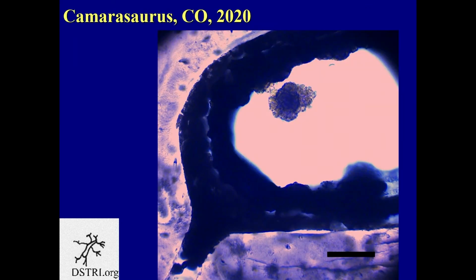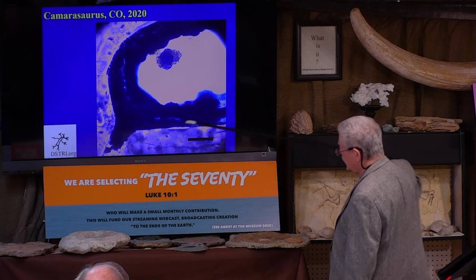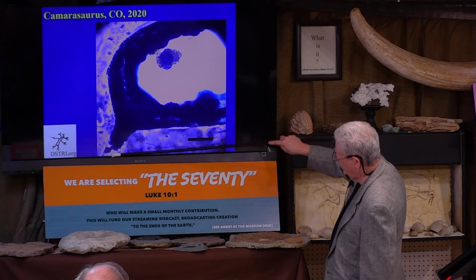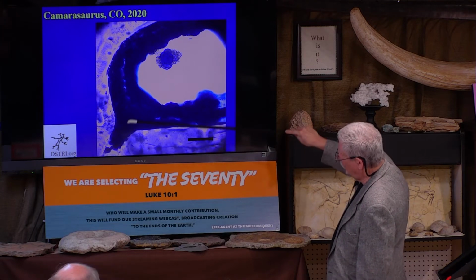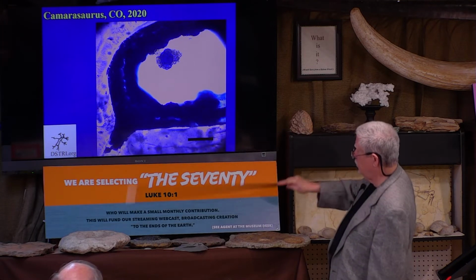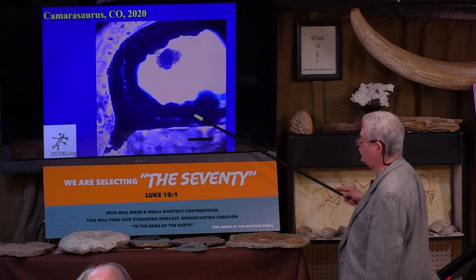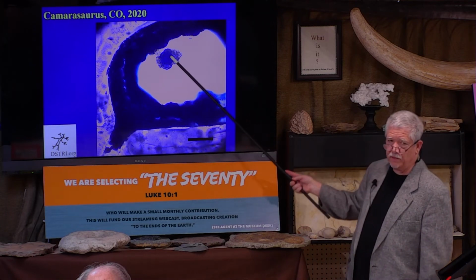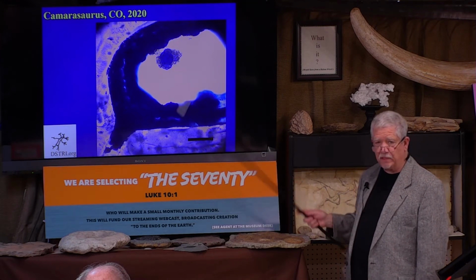So when we make a thin section of the bone, we can see the canal. This is the bone canal here. And all of this dark stuff, that's the clot. You can see it going off into another canal. See this little canal here? So this is probably a Volkmann canal between two Haversian canals. But this is all clotted blood. It's all crystallized. Here's a framboid. Okay? So now you're seeing a framboid in thin section.